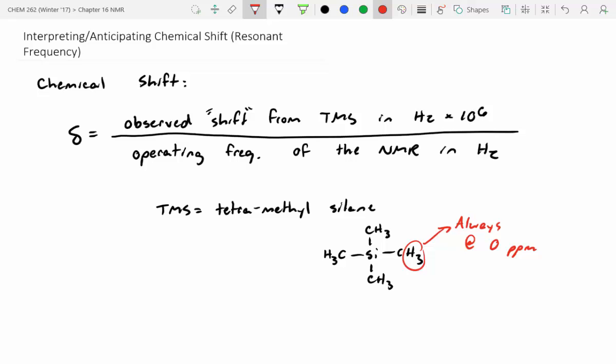Going off of that, when you're taking NMR spectra and you're picking out a solvent, what's the most important feature that your solvent must have? Does anybody know based off of the book? Deuterium, right? Why do we have to pick a solvent that only has deuterium atoms in there? Organic solvents are a lot harder.